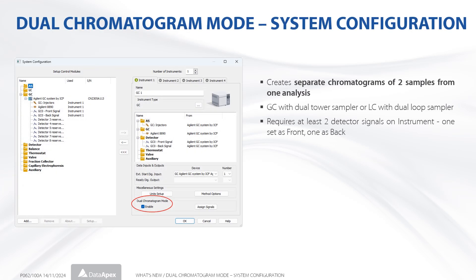The dual chromatogram mode enables use of chromatographs processing two samples simultaneously — a GC with dual tower sampler or LC with dual loop sampler. Each analysis will produce two separate chromatograms. It can be enabled using the checkbox in the dual chromatogram mode section of the system configuration dialog.